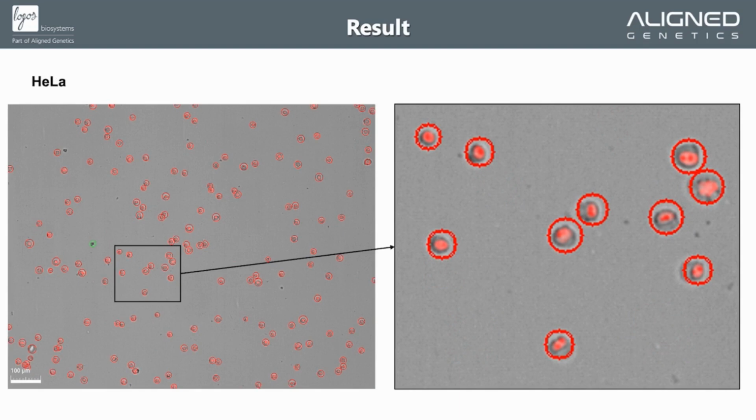However, extracting nuclei from adherent cells, such as HeLa cells, was relatively harder for us. So we had to optimize surfactant concentrations and incubation time to effectively isolate nuclei from adherent cells.